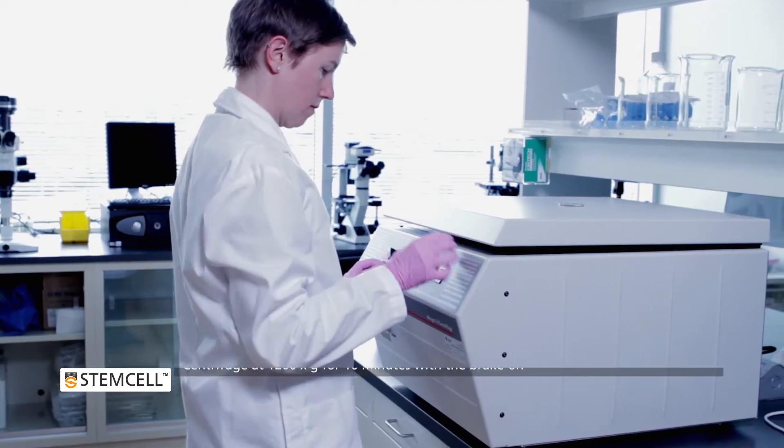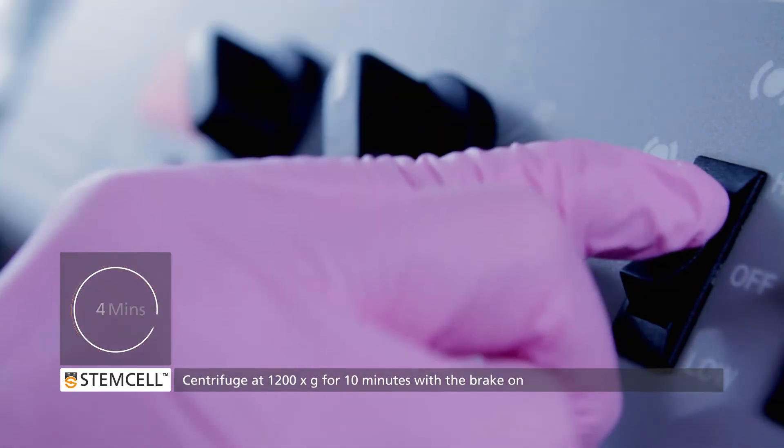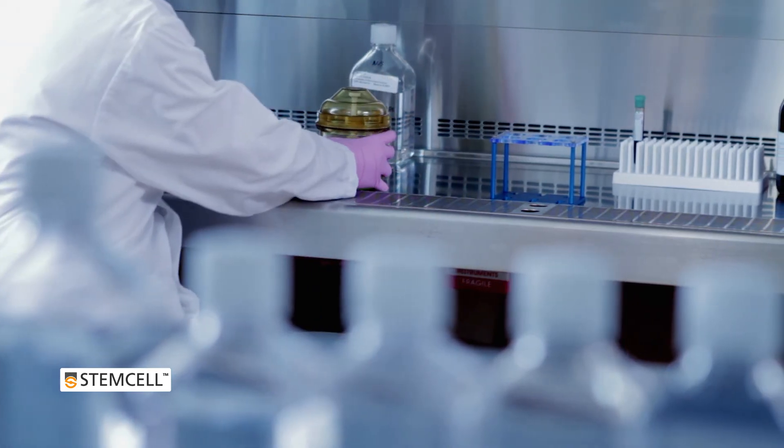Next, centrifuge the samples at 1200 times G for 10 minutes, at room temperature, with the brake on. SEPMATE prevents the layers from mixing as the centrifuge slows down.